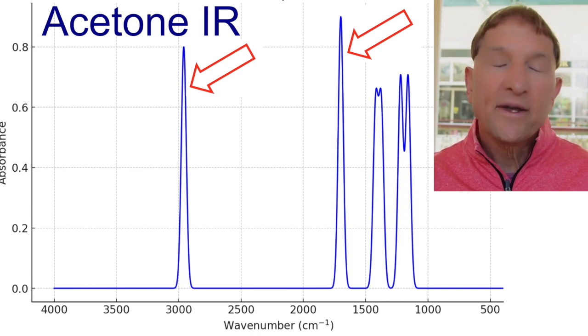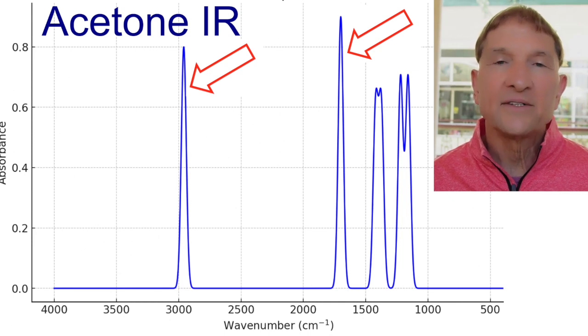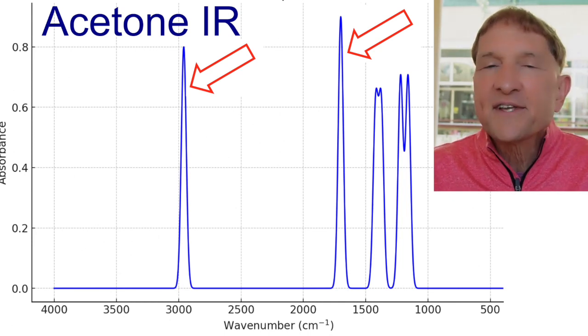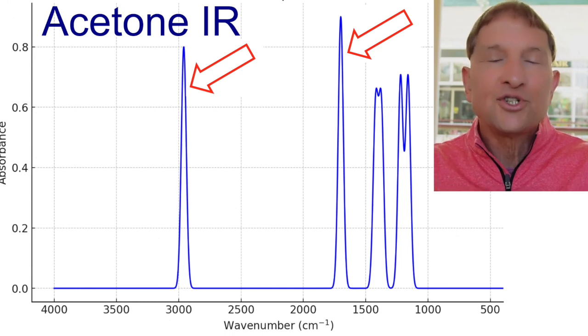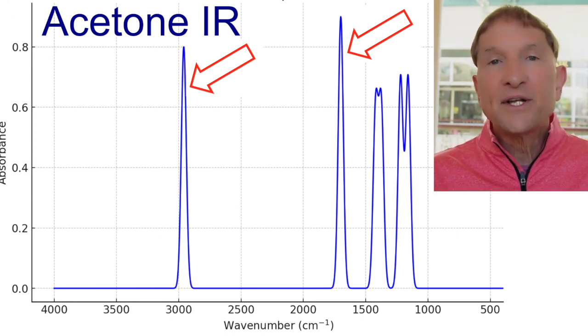CH3 stretch wave numbers are worth remembering because nearly all organic compounds have them. This helps not misassign those peaks to something else and to calibrate sp3 carbon-H and sp2 carbon-H, as I mentioned already.